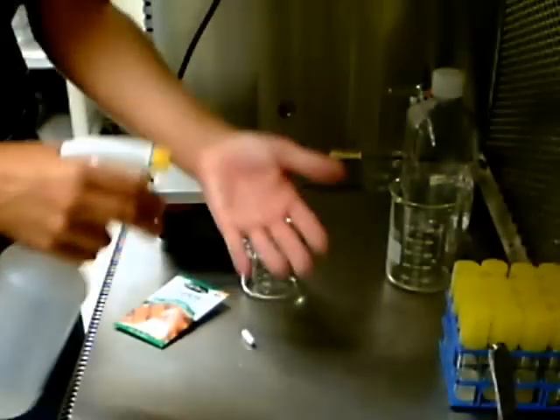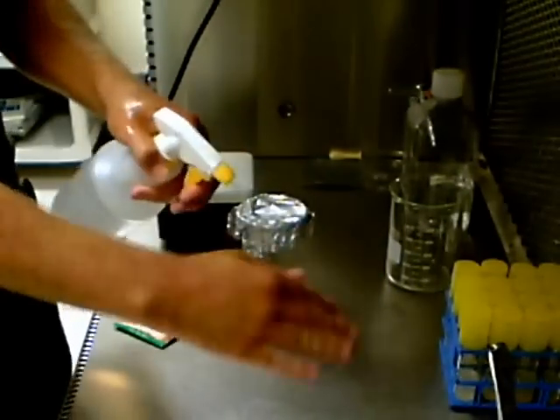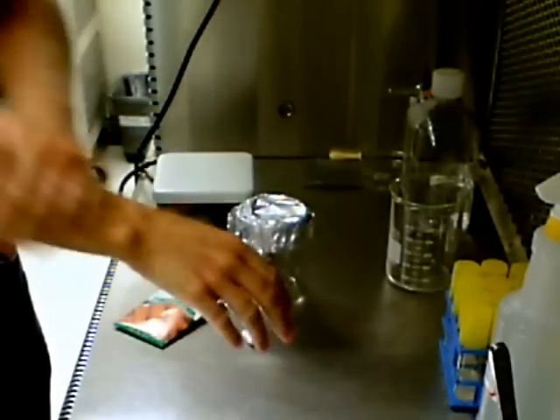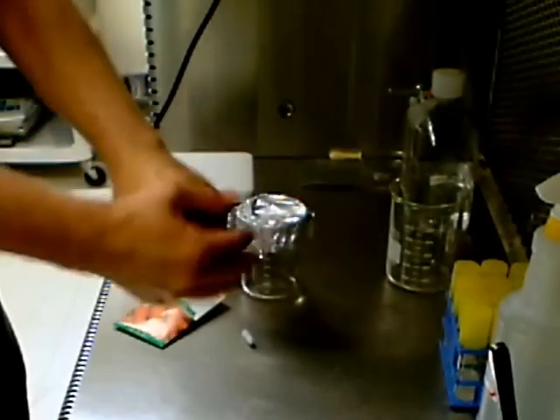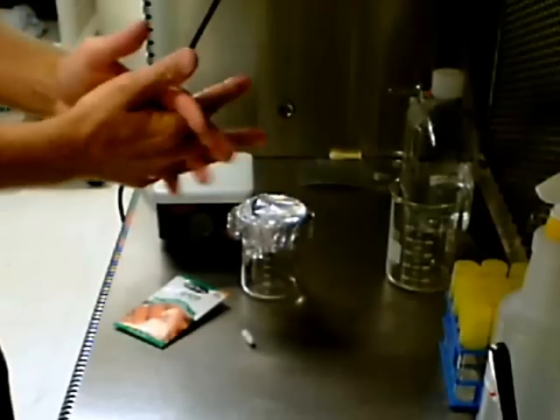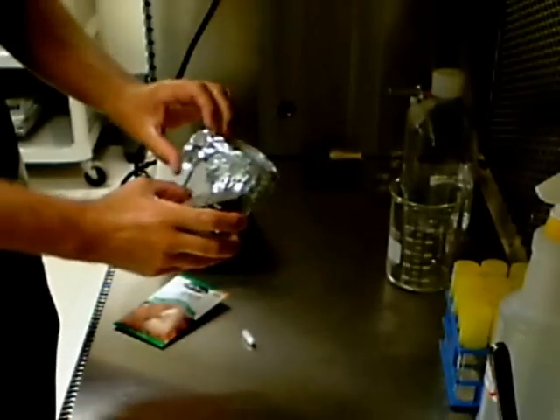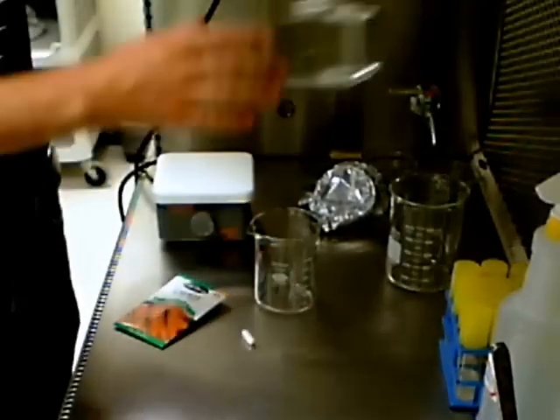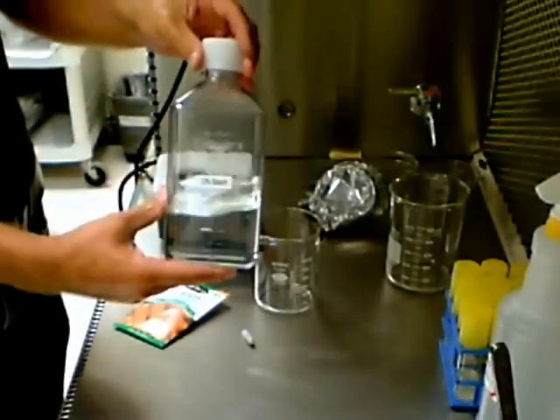The first step is to surface sterilize the seeds using a 10 percent solution of bleach and a drop of detergent. Begin by washing your hands and spraying them with a 70 percent solution of ethanol. Add about 200 milliliters of the bleach solution to a beaker along with a drop of detergent and the stirring bar.